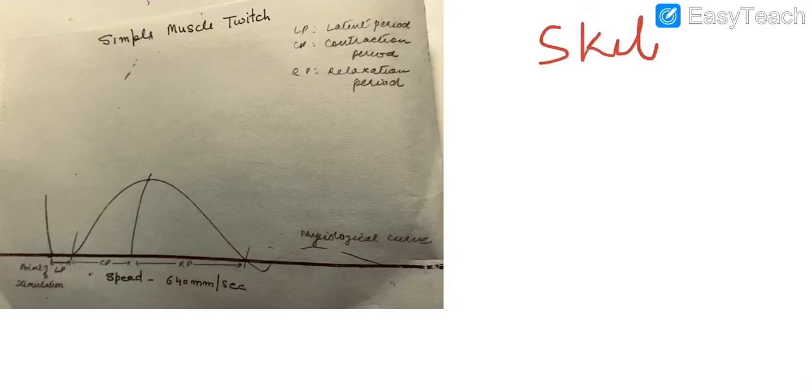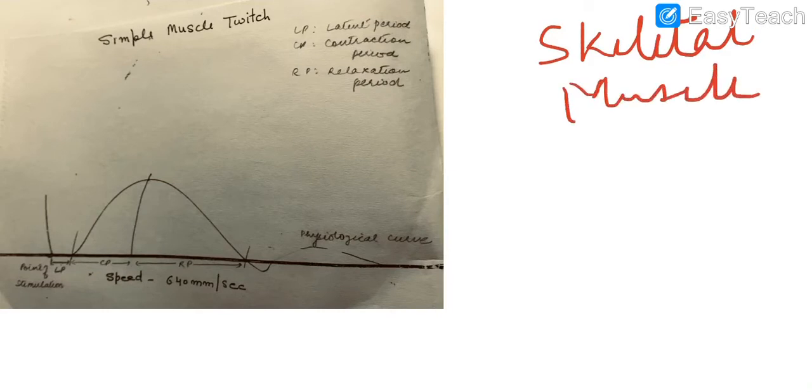as well as the cardiac one. Okay, so first we will start with the skeletal muscle graph. What is the significance of doing these graphs?